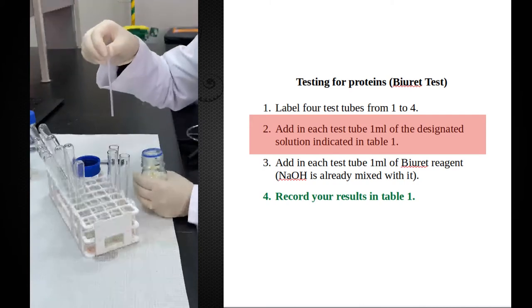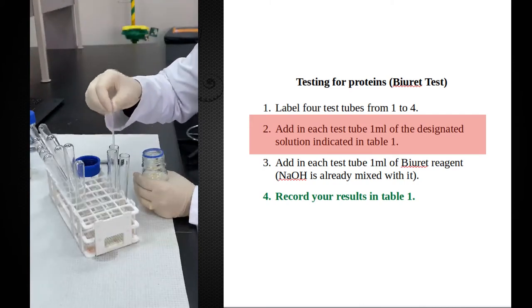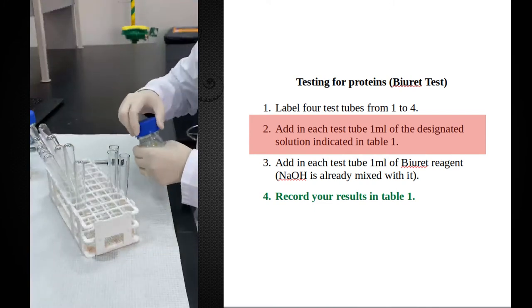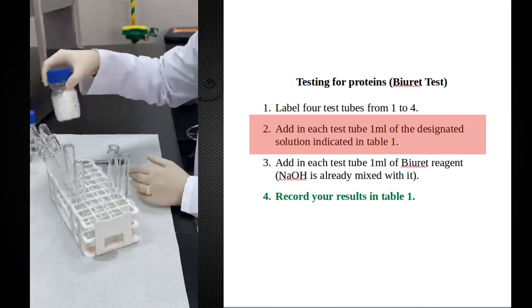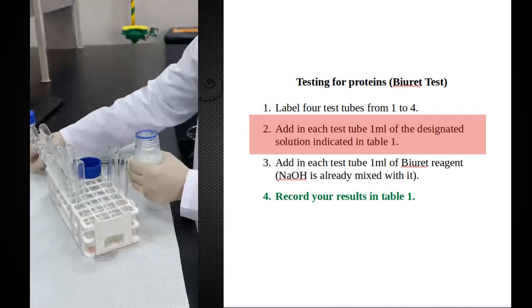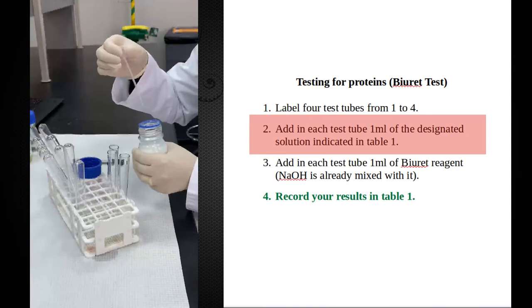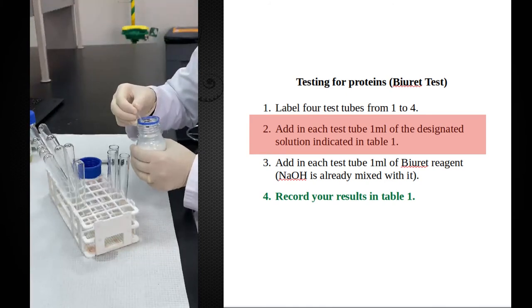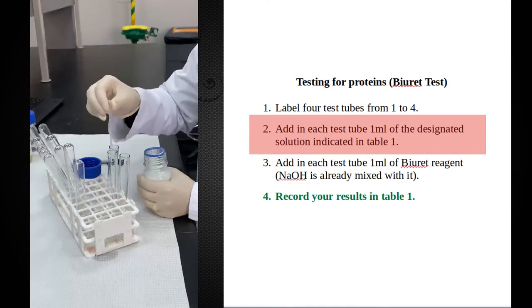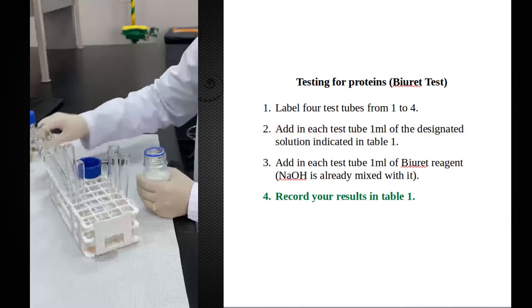And I am going to test milk to check if milk contains protein or not. In your experiment, you will also have to check your unknown solution that you are identifying its composition. So you should have a fourth test tube.